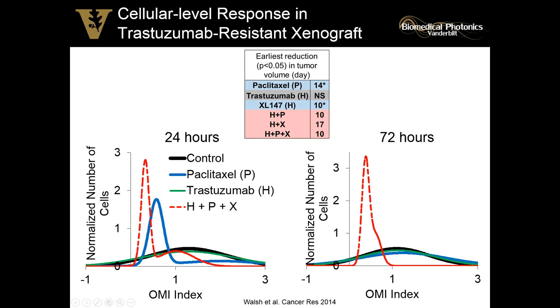However, if you look at a combination treatment group, this is all 3 drugs together, we see an initial bimodal response, and then at 72 hours, we see that this bimodal response is becoming more unimodal and less overlapping with the non-responsive groups. So this is an interesting way to monitor the response of cellular subpopulations to see how they change with sustained treatment.